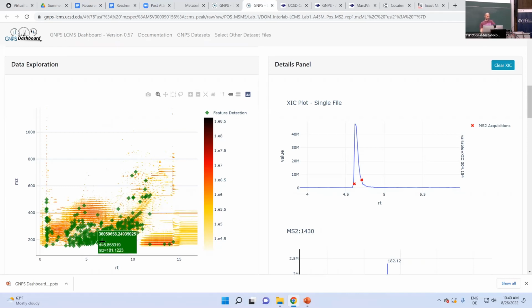So here, these are the different features that were recognized throughout my map. No. This is for all. This found all features, right? Yeah, so there is a lot missing, right? This entire range here where we had a lot of MS2s placed, which was really nice, there are no features found. So I would say, I mean, it's kind of okay, but it's not really deep, right? So most likely I selected too high a threshold.